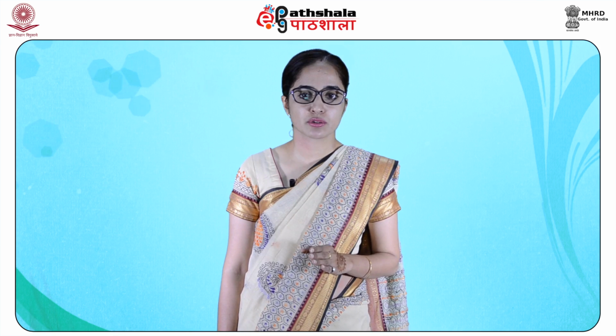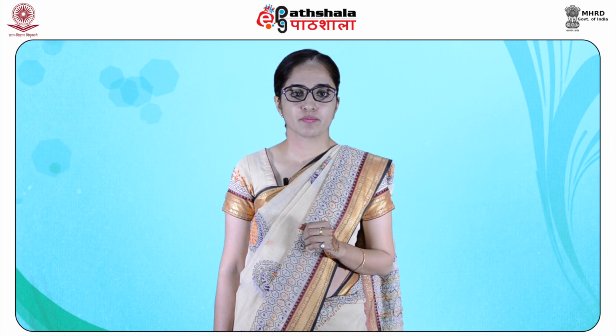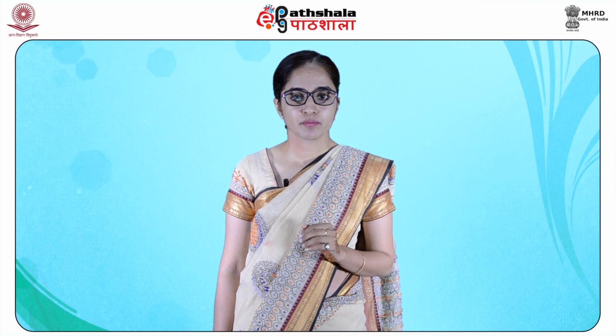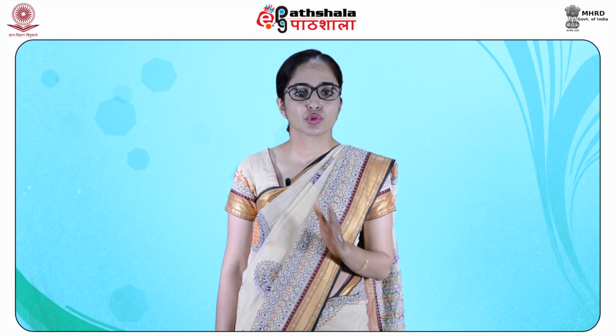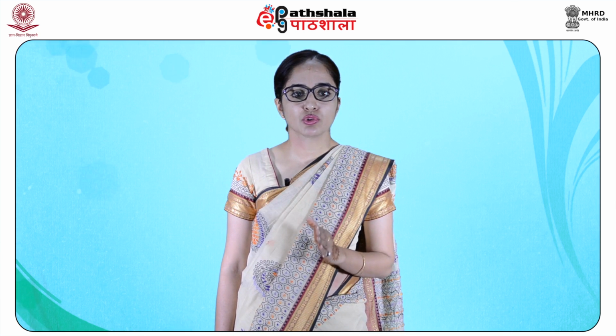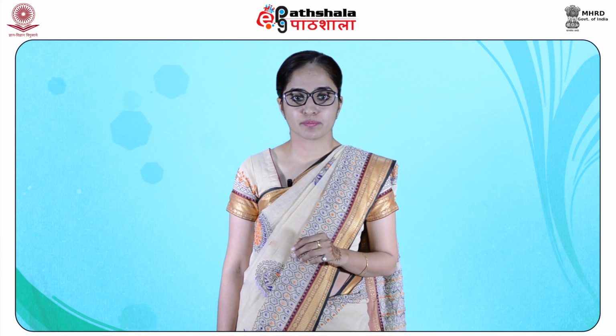In this system, students, two magnetically equivalent protons are coupled to the third proton, which has a comparable chemical shift value to the other two protons. As the ratio of the chemical shift difference to the coupling constant is very small, each line of the doublet is further split into 2 and also the center line of the triplet splits into 2, thus producing a total of 8 lines in the spectrum.